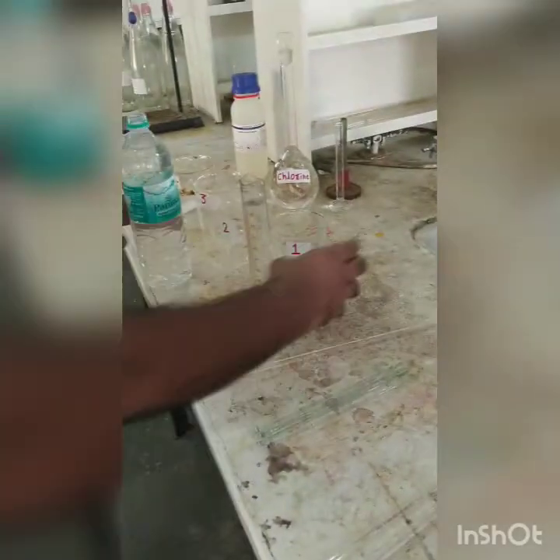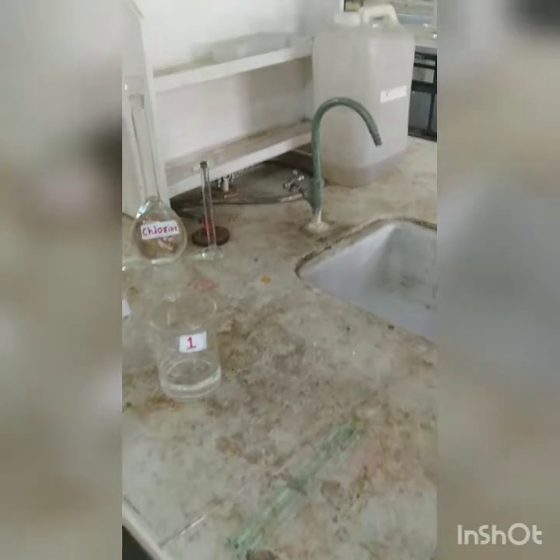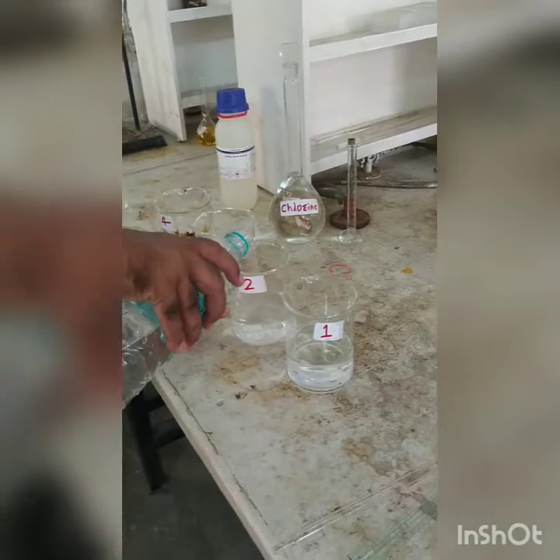So now we are taking 200 mL of the sample in 4 beakers. So this is the sample and we are taking 200 mL of the sample. Now to this we are going to add varying dosages of chlorine. How will the varying dosages of chlorine be added? It is based on the concentration of chlorine in the given chlorine solution.